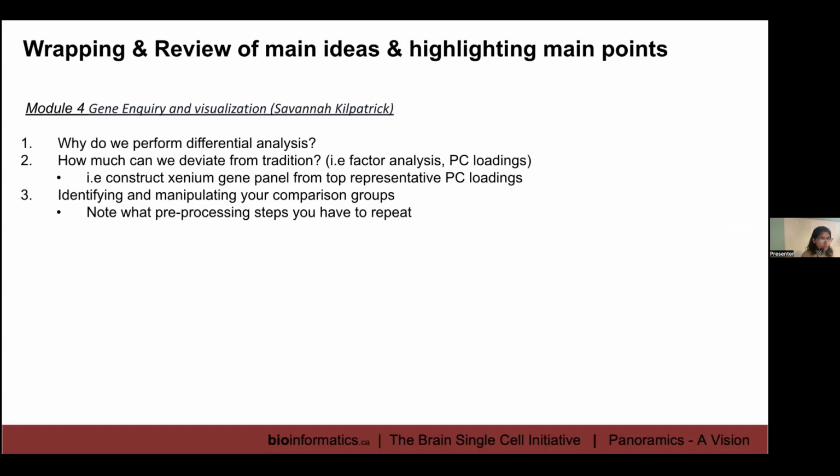So all these pipelines are a general pipeline for you to use as a guide, all right, so you can kickstart your project, but also feel free to manipulate your data set as you see fit. What you subcluster and what you investigate, and the regions of choice, can always form a hierarchy. It doesn't mean that if you normalize once at the beginning, you cannot subcluster and renormalize and recluster and do another differential analysis.